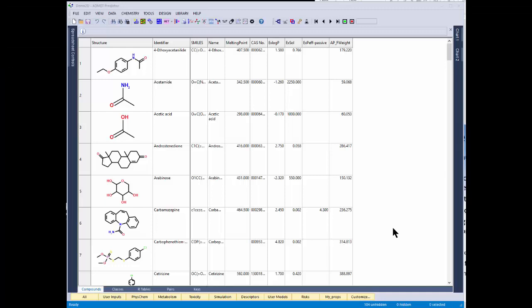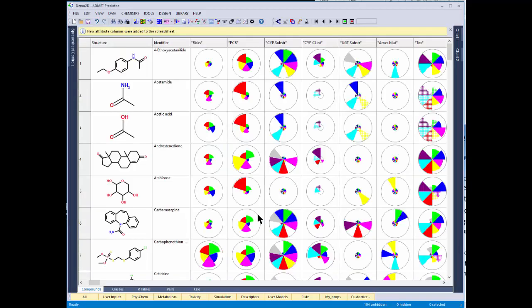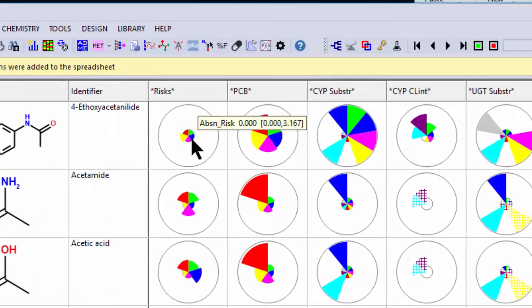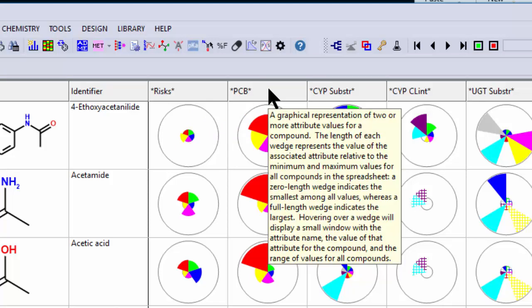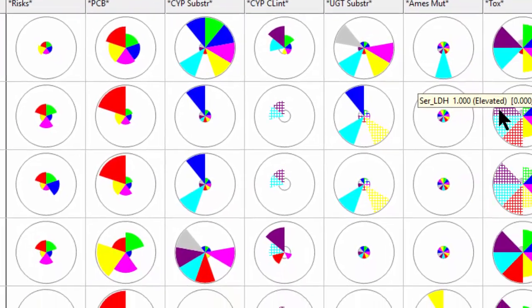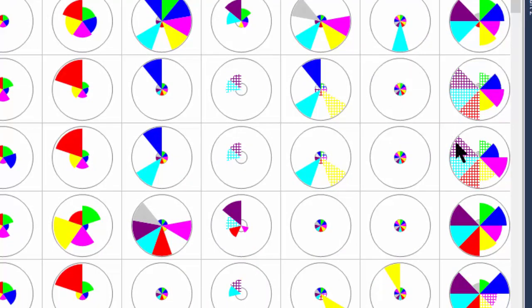Now let's see what this looks like in action. I've read in demo2d.smi, I'll click the ADMET button and calculate properties. This calculates all the descriptors and then uses those descriptors to produce the models. The first thing you'll see in the spreadsheet are the various risks — the ADMET Risk, the Absorption Risk, et cetera. In order to look at these, you simply hover your mouse over that star plot to see the relative values. The next columns are PCB, CYP substrate, clearance, et cetera. If you see hashed ones, this means that this particular compound is out of scope for this model — that's what the hashes mean.